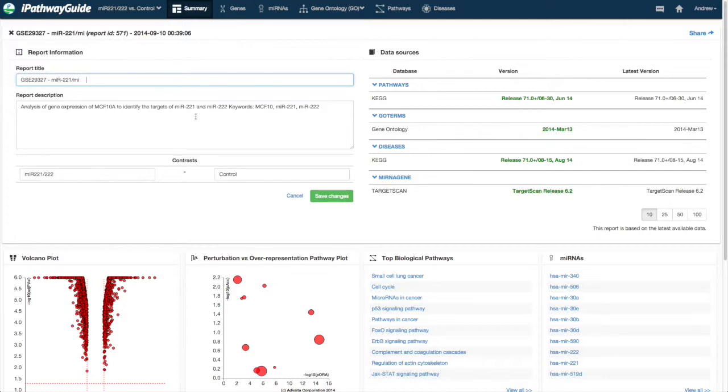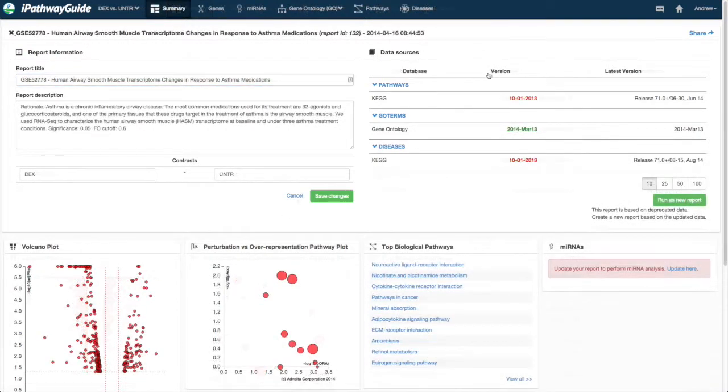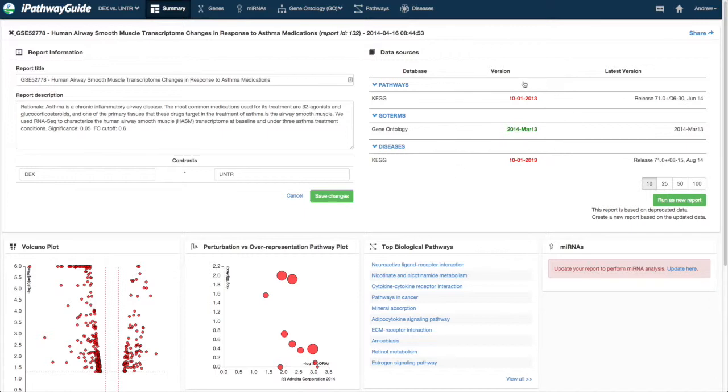In this section, you will also see information related to the databases used. In this example, the database information has been updated since the report was run. You will have the opportunity to re-run the report.